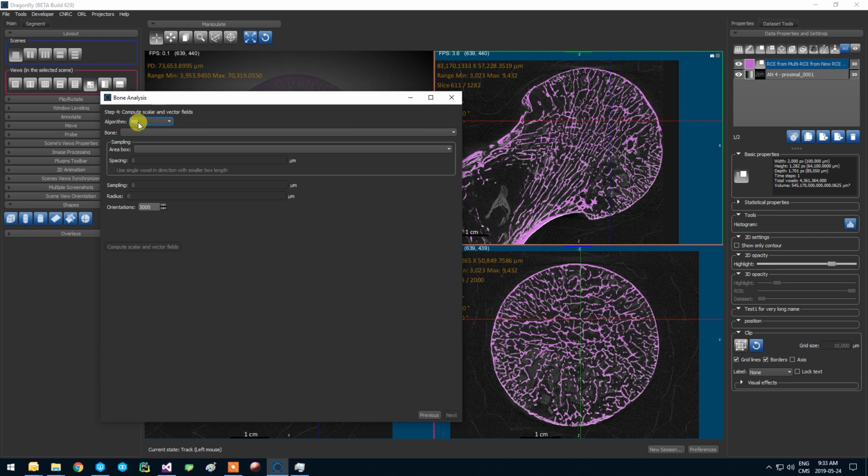And for this, we'll have to specify a grid where on each point we will compute this anisotropy value. We would have the different stars put at each grid center, and we'll compute the best fit ellipsoid at that place, which will give us the actual anisotropy for that point, and we will repeat this procedure on every point of the grid.